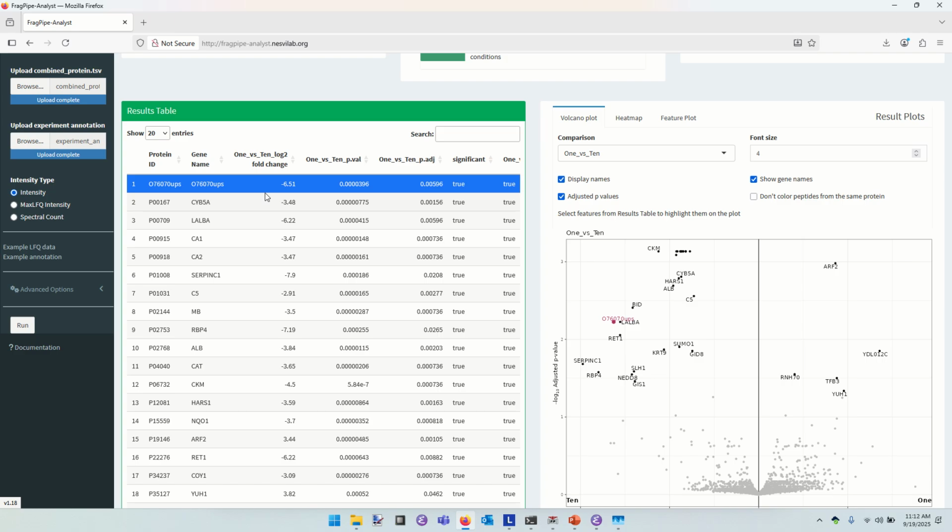So there's some bounce in the ratios estimated by these things. Occasionally you're going to have too high a ratio inferred for a protein than is real, as in this case. And it works the other way. You might have a protein that you know is 10 times more abundant that gets measured as 4 times more abundant by the software.